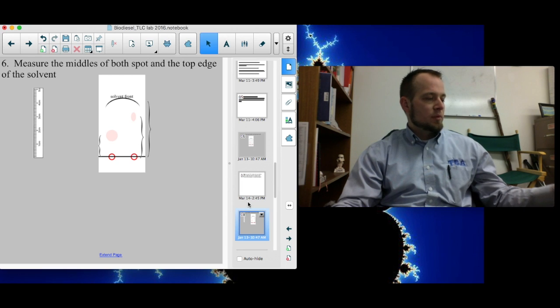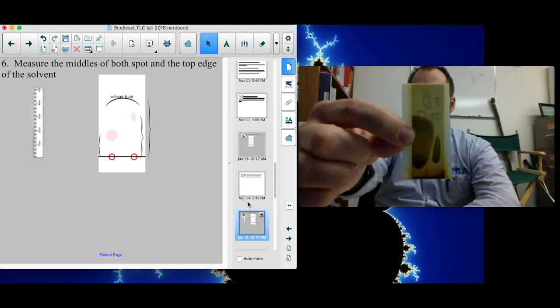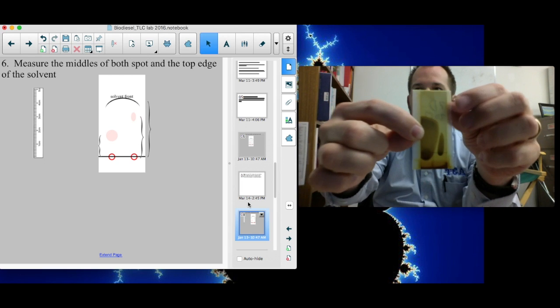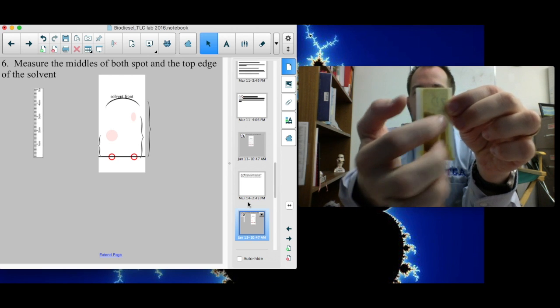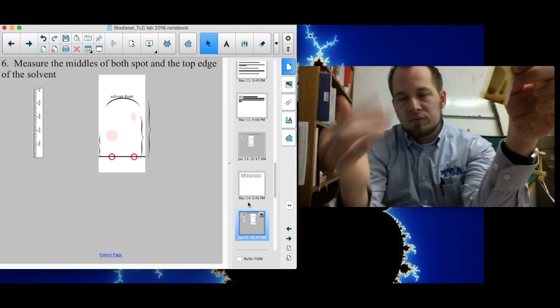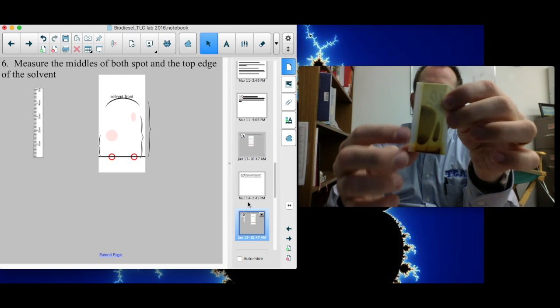So here's an example of a real one, just like this. Hold it up pretty close here. So this is a TLC plate for our two substances. Now on this side right here, this is the biodiesel. Now it's spread out a lot, so it's not necessarily pure. Biodiesel isn't pure. It's got a lot of different chemicals that all count as biodiesel. So it moves all the way up to here. You can see a pretty good spot.